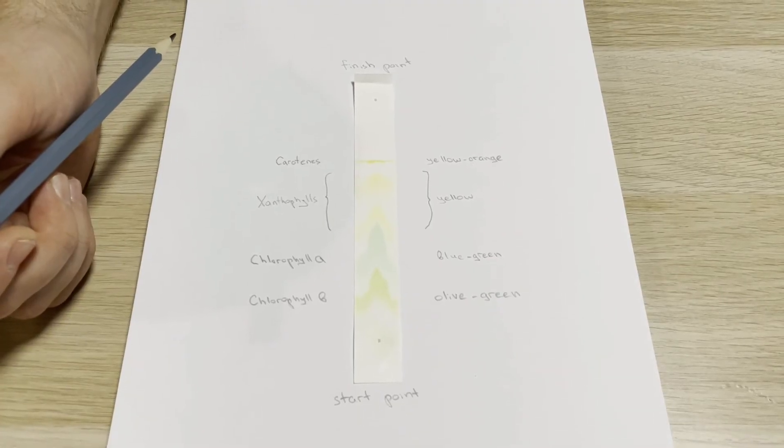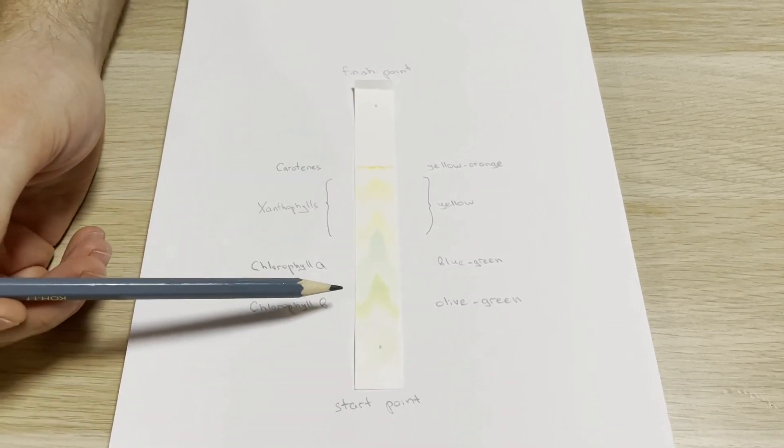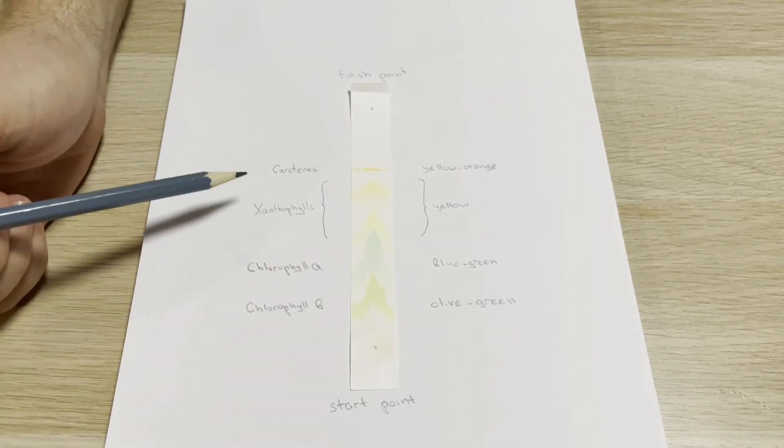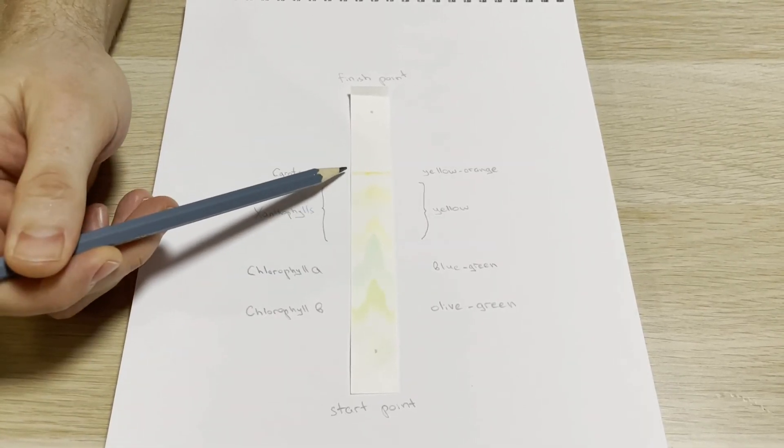After 10–15 minutes, let's check our results. From the start point, we can see chlorophyll B is olive green, chlorophyll A is blue-green, xanthophylls are yellow and carotenes are yellow-orange. Moreover, you can examine your chromatography paper and pigments under UV light in a dark room. Just be careful and do it really quickly, because even a safe UV light from the torch can damage your eyes. You can see that chlorophyll and carotenes are fluorescent molecules and when viewed under UV light, glow red.